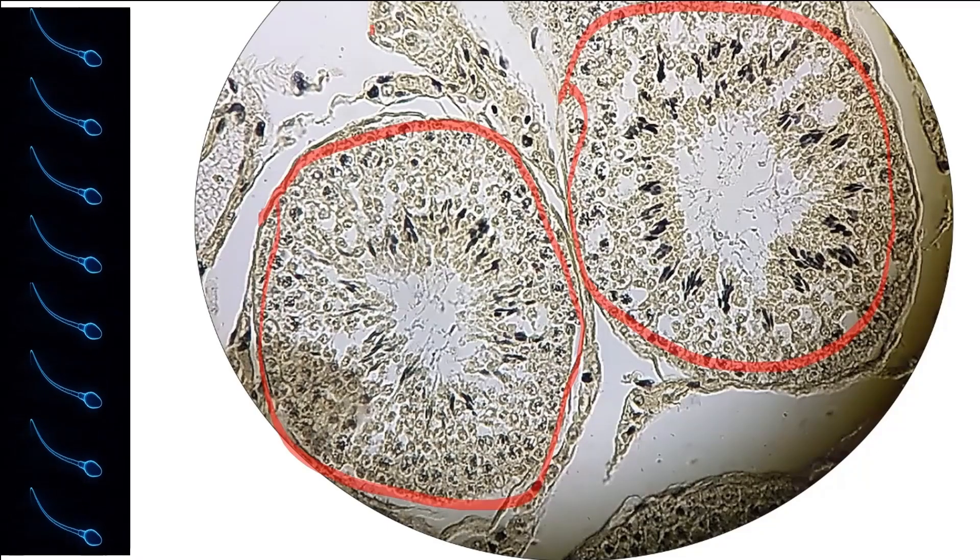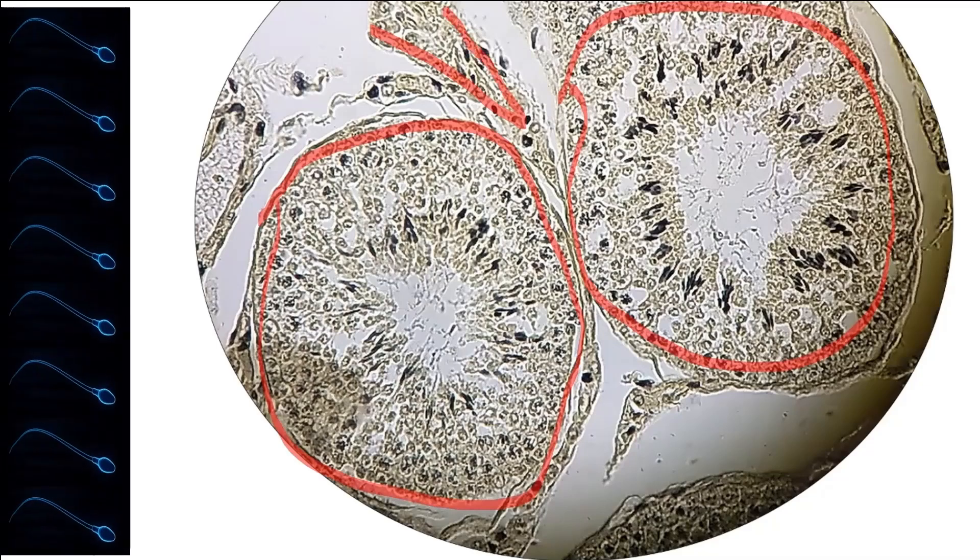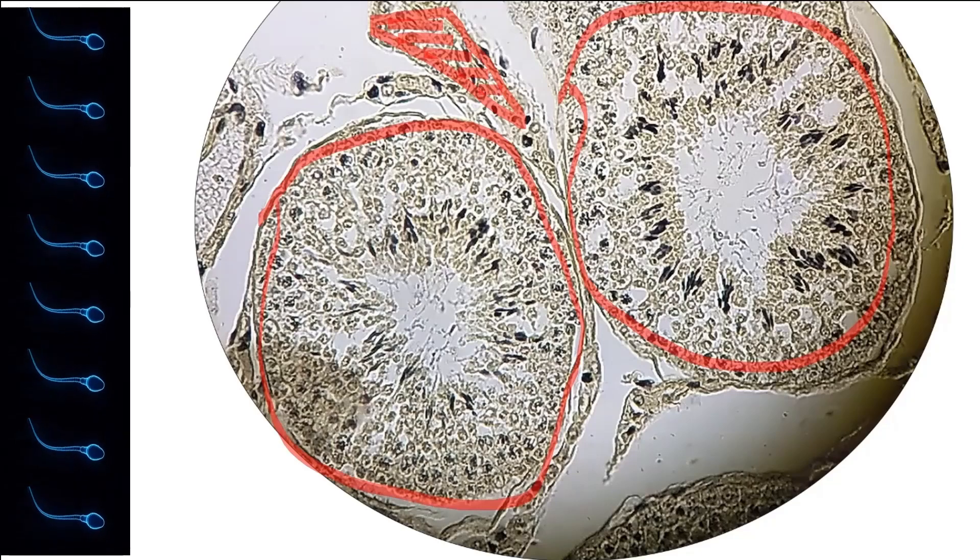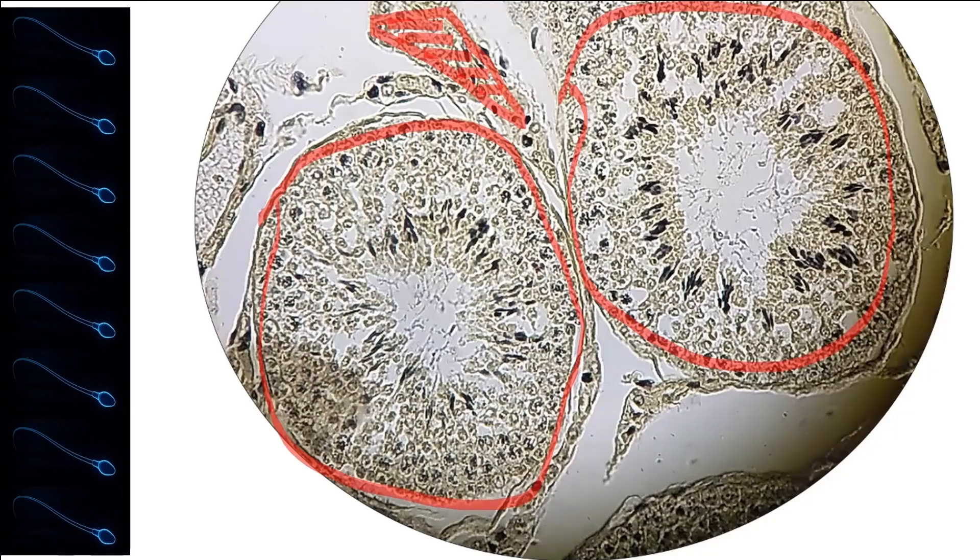You can see there is connective tissue located outside of the seminiferous tubules. This is a Leydig cell that is responsible for producing testosterone.